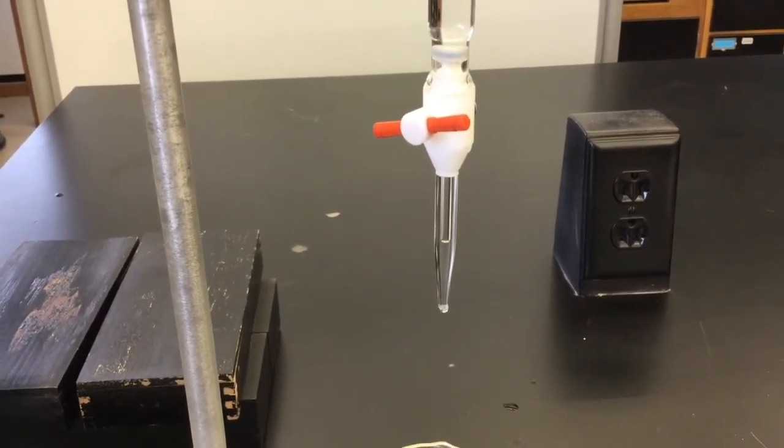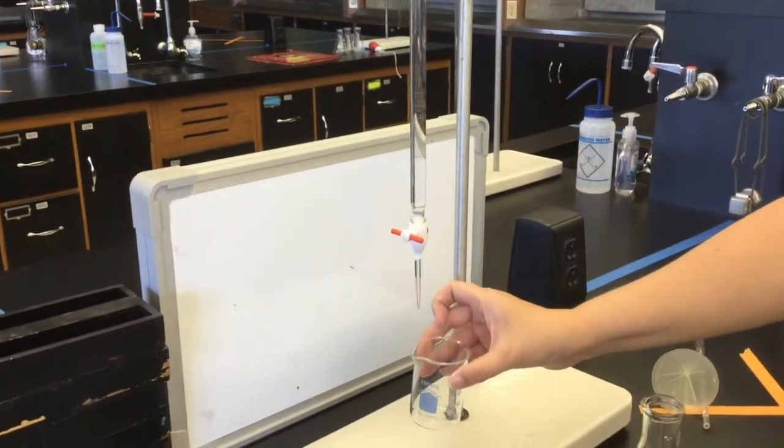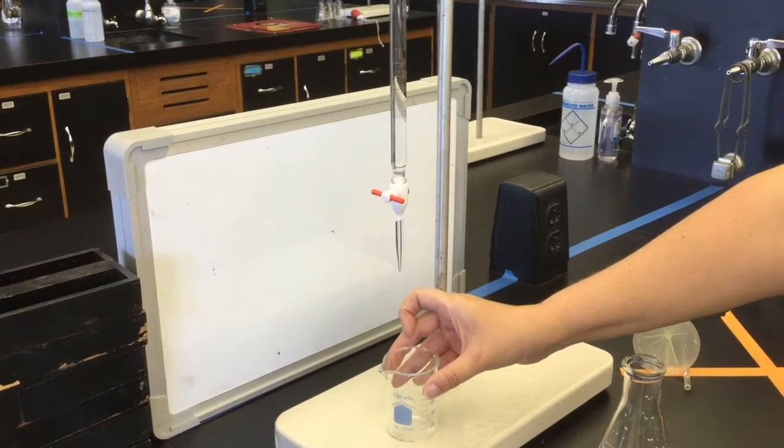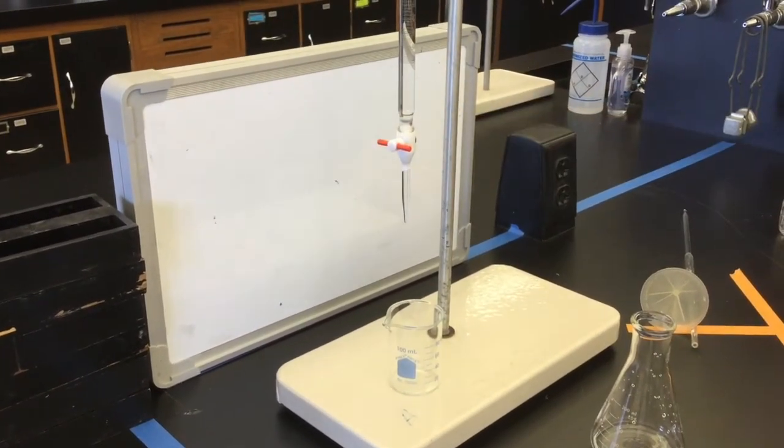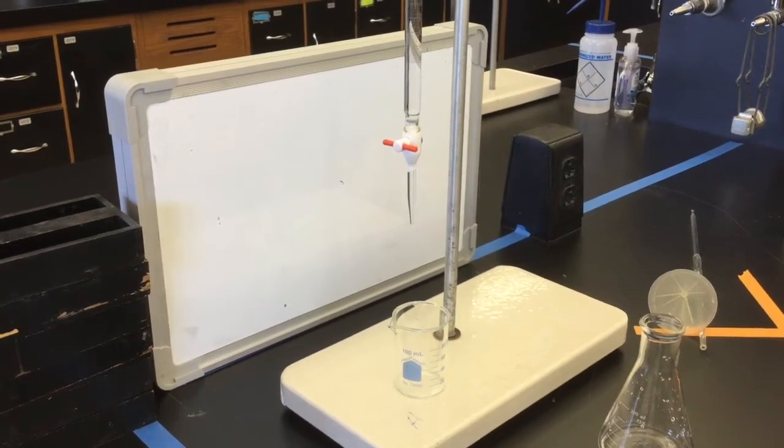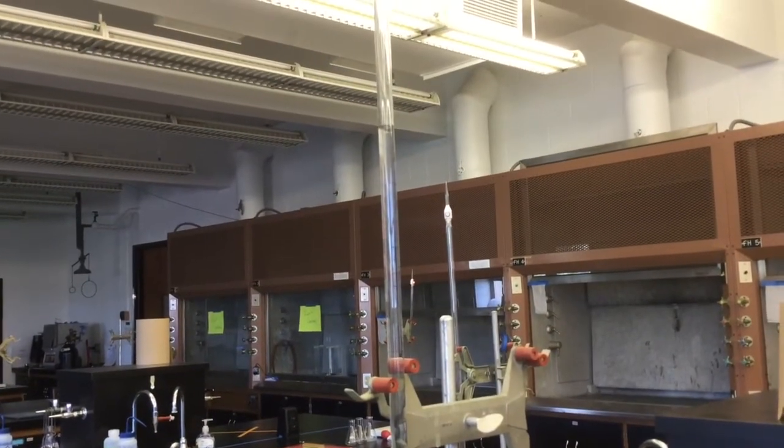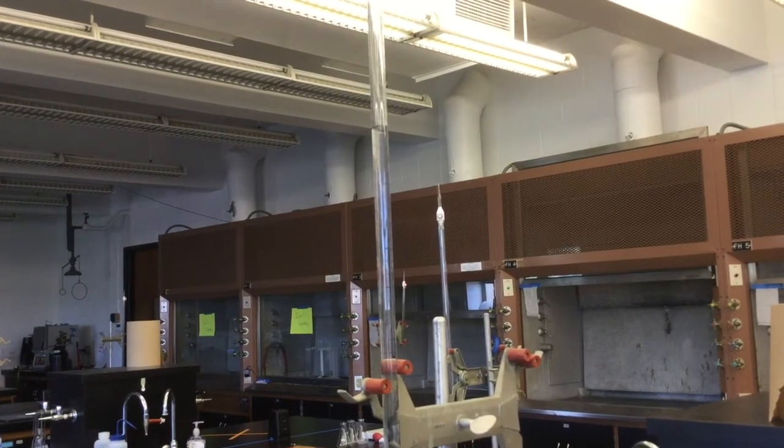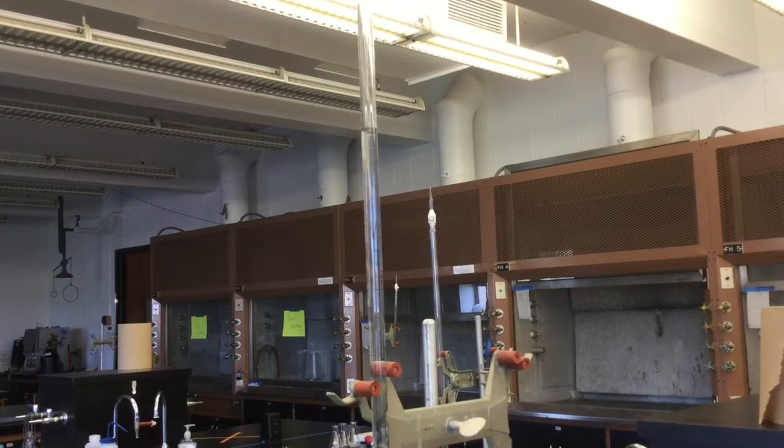So we want to make sure before we start that the air bubble is gone. Take one of the small beakers from your drawer, place it underneath the burette, and then open the valve for just a second to make sure all the bubbles come out. Check again to make sure that you're still above the 10 milliliter mark before you proceed. You only need to use a little bit of the sodium hydroxide in order to clear out the bubble.